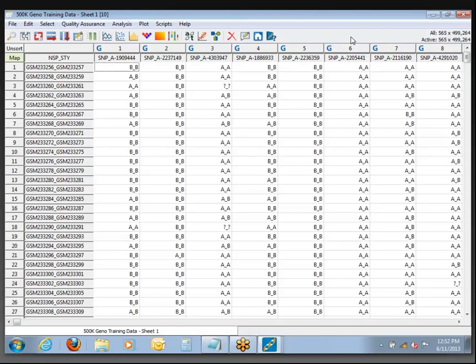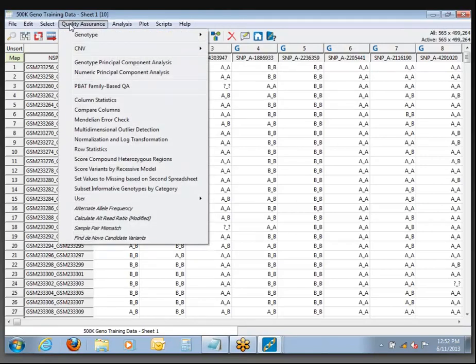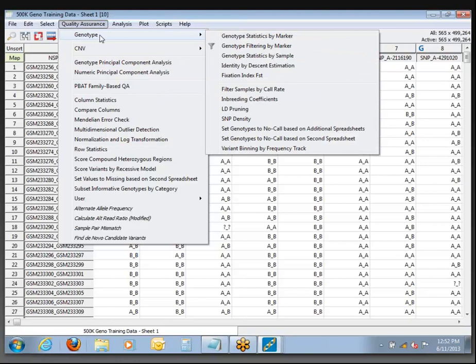What we want to do now is calculate some sample-level statistics. Earlier this morning I showed you how you could get genotype-level stats — call rates, allele frequencies, and such. But if you want sample-wise call rates, look in the Quality Assurance menu. There's a whole list of different things that can be done here, but what we want to focus on is the Genotype submenu, and specifically Genotype Statistics by Sample.